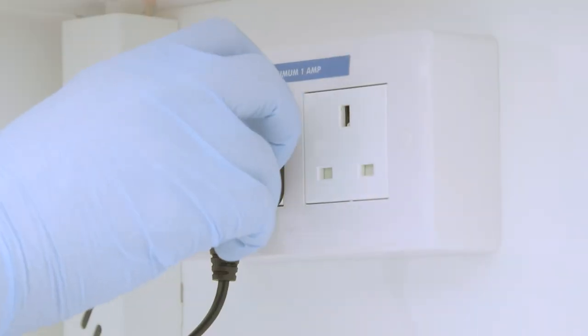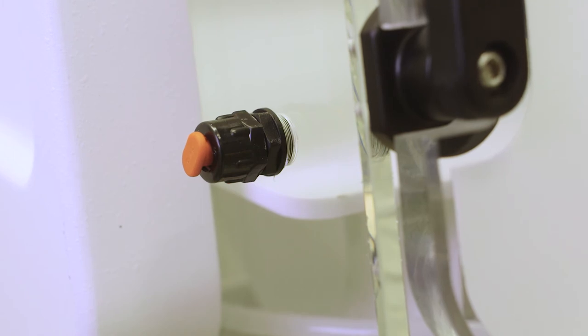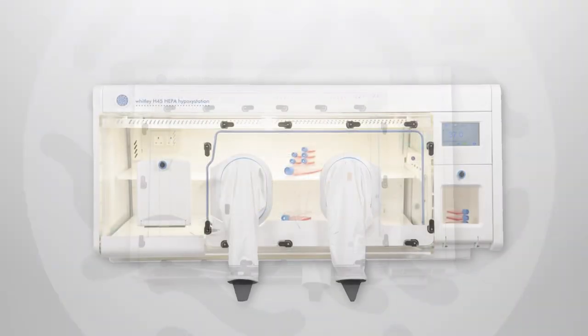Hypoxic stations can be fitted with an internal power socket and a variety of cable glands can also be specified. Whitley hypoxic stations are available in a number of different sizes to suit a range of applications.